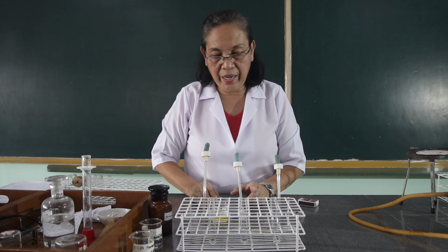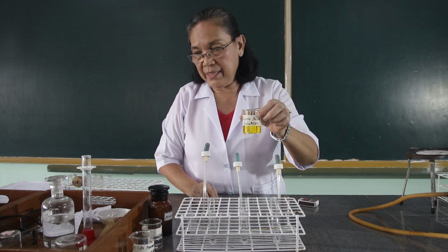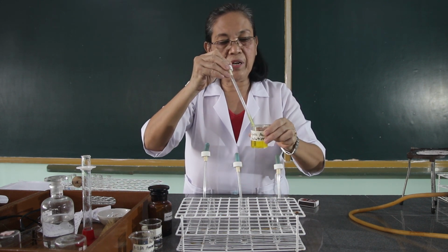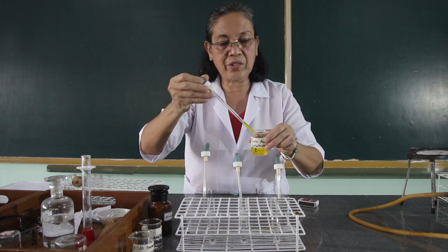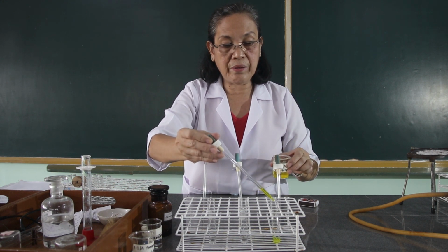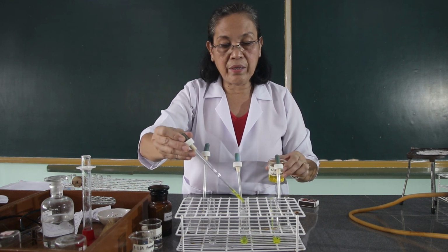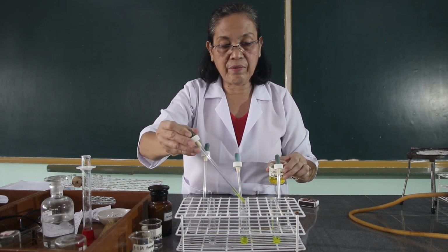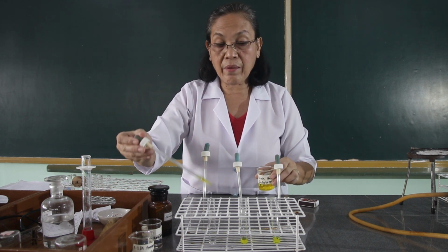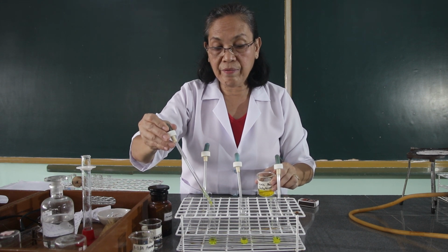To these three test tubes, we are going to add the picric acid. So let's add 5 drops of the picric acid to each tube. 1, 2, 3, 4, 5.